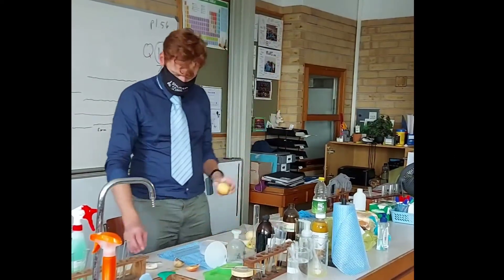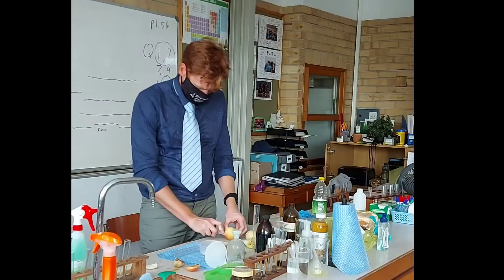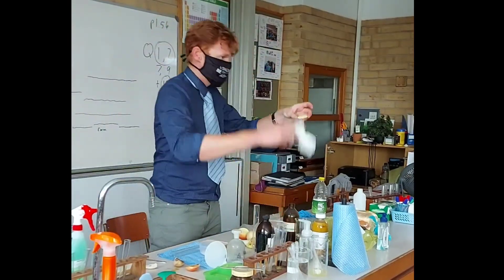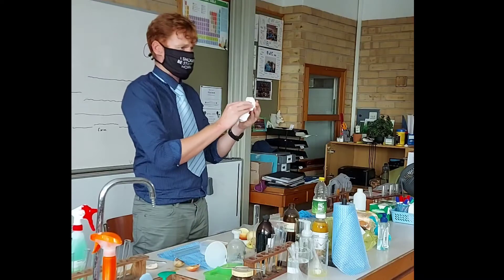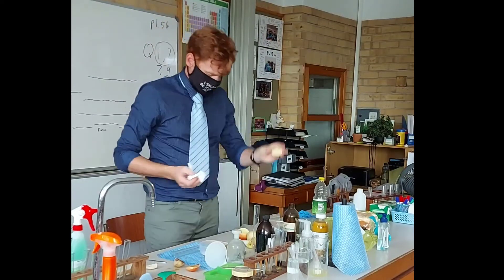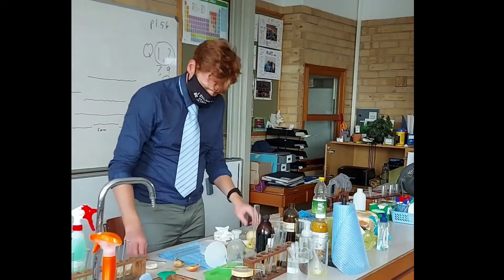We're going to cut the apple — a little piece of the apple. Just take some paper towel and press it firmly to take up all the sap. And then we'll take a piece of potato.